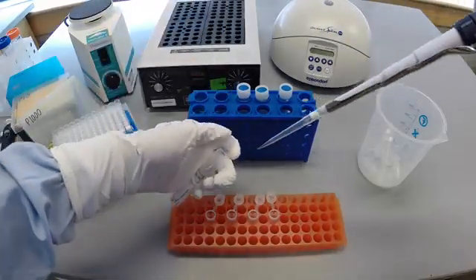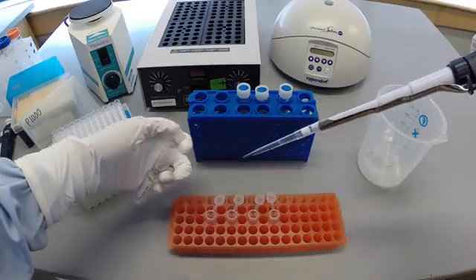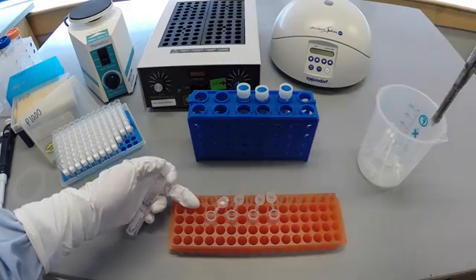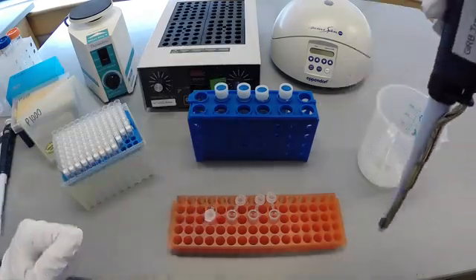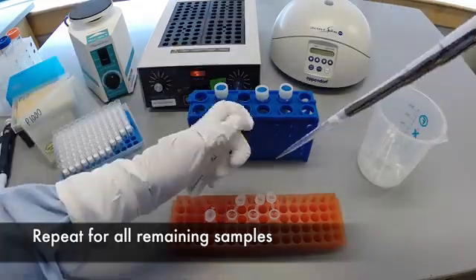When pipetting large volumes, draw up the solution slowly to avoid bubbles or contaminating the micropipetter. Once the solution is transferred, close the spit tube lid and cap the sample. Repeat this process for all remaining samples.